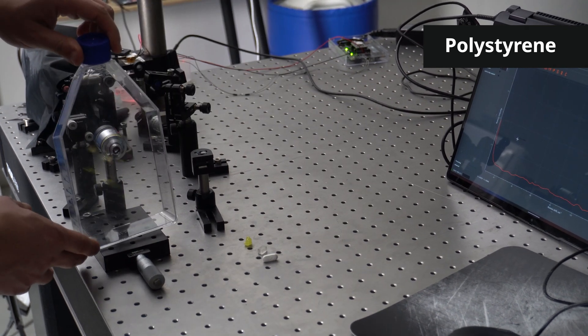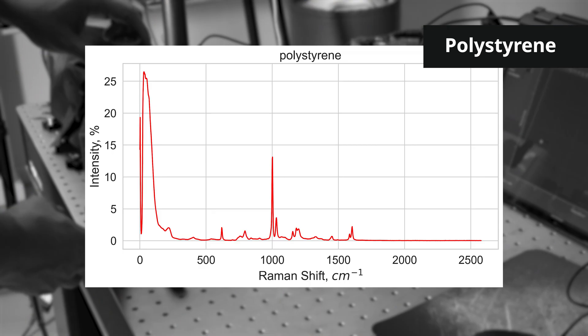Now let's take this polystyrene bottle and measure it. As you can see, the setup allows to measure samples of different shapes and sizes. We slightly adjust the focus to improve the signal. Here you can see a typical polystyrene spectrum with an intense 1001.4 wave numbers Raman line.